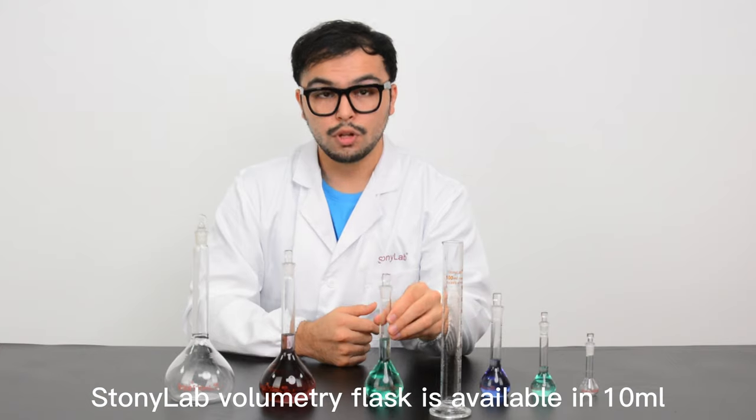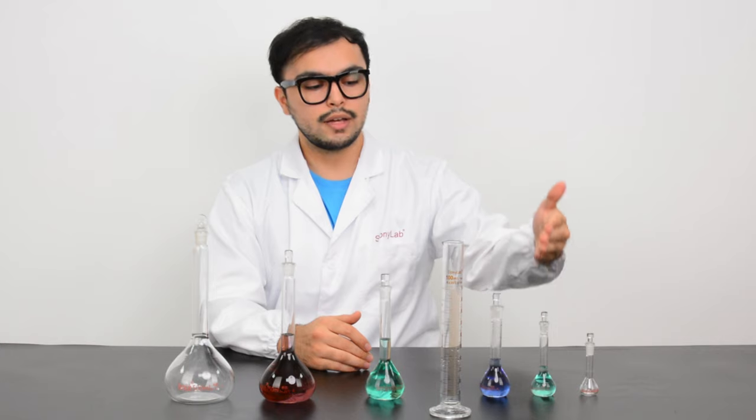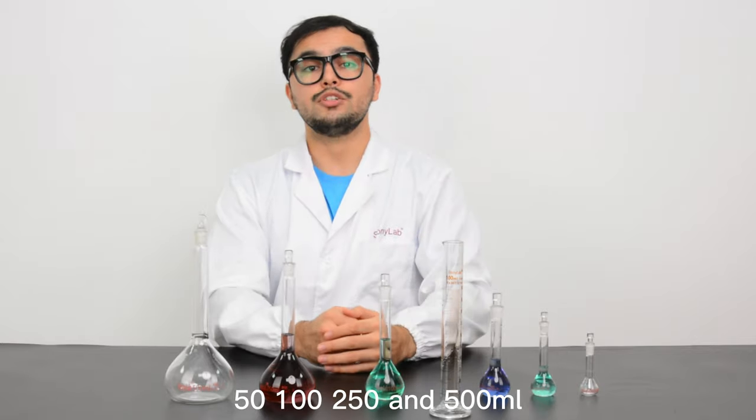StonyLab volumetric flask is available in 10ml, 25ml, 50ml, 100ml, 250ml, and 500ml.